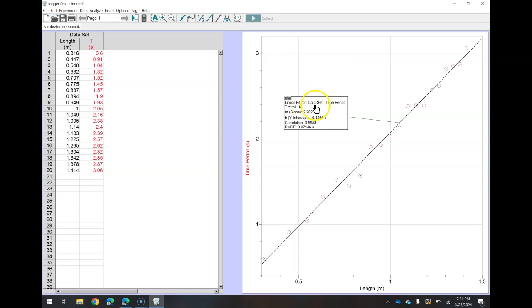Okay, so I want to label this with an annotation. So go to Insert, Text Annotation, Best Fit Linear Trend Line. Something like that. You have to click out of the box, and then click and hold the box to drag it around. It's kind of annoying to get it to do what you want. All right. Move. It's got a little hand. This little hand has to pop up, and then you can drag it, and then you can drag the point of this line and point it there.